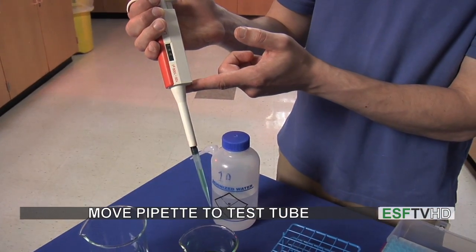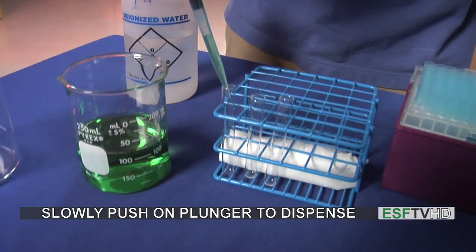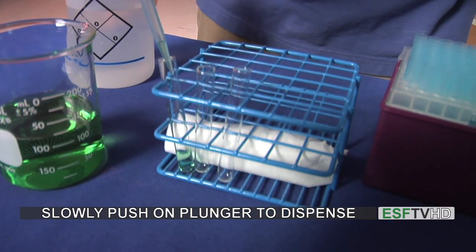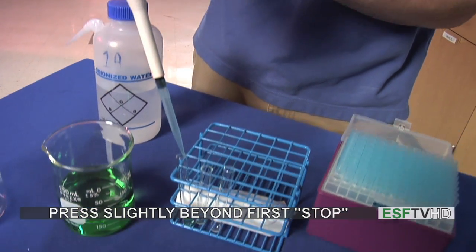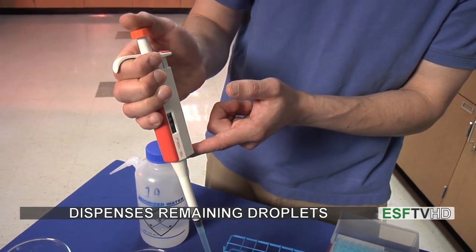I'm going to move to my container, which is a test tube in this case. I put it in the test tube and eject. When I eject, I'm going to slowly push down on the plunger, and we can see the liquid being dispensed. Now I've reached that first stop again. I'm going to push a little bit more just to make sure any droplets left in there have been dispensed.